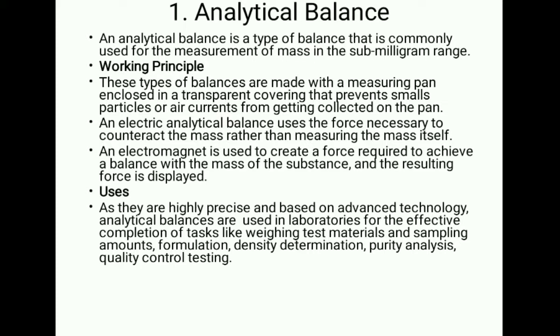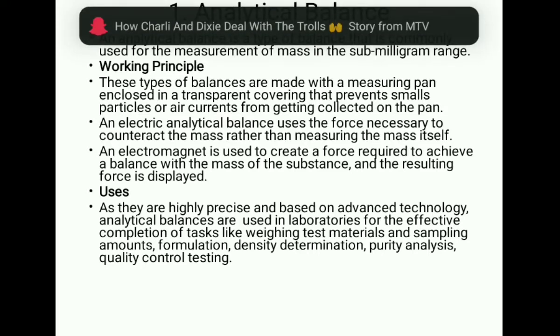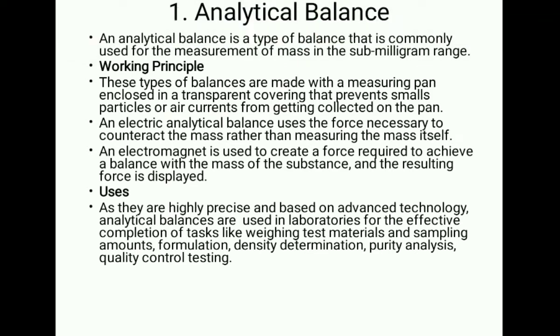An electric analytical balance uses the force necessary to counteract the mass rather than measuring the mass itself. An electromagnet is used to create a force required to achieve a balance with the mass of the substance, and the resulting force is displayed.